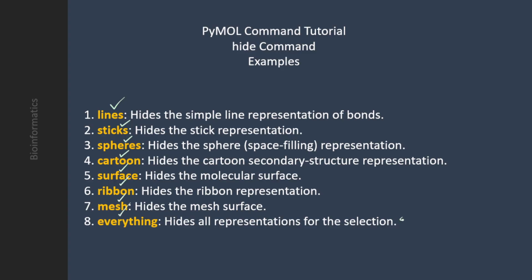Everything means if you want to hide everything of that particular selection, whether it is protein, whether it is atom, whether it is residue. So if you use this everything keyword in that command syntax, everything is going to go away, right? So you can use everything along with the hide command to hide everything.